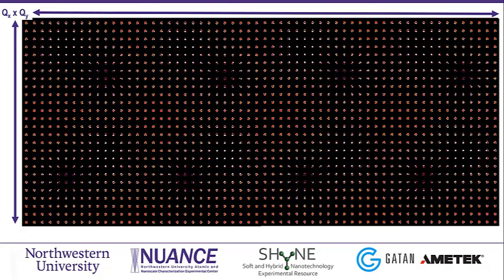And for that, later, Anna and Stephanie will show some examples using Digital Micrograph, Gatan software, and also Python, which is a more flexible way to extract that information. So as you can imagine, each of these diffraction patterns carries a lot of information that can be retrieved.